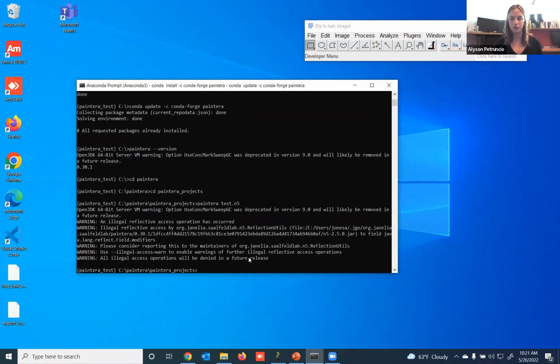Okay, so now what we're going to do is open some cropped raw data as an HDF5 file. And this is something that we do in CellMap because as easy as it is to annotate full N5 data sets in Paintera, oftentimes we don't need to import that much data. And so we'll often default to a relatively smaller crop, although it is still fairly large. So what we're going to do now is open a new project. I'll call this cropped labels.n5.